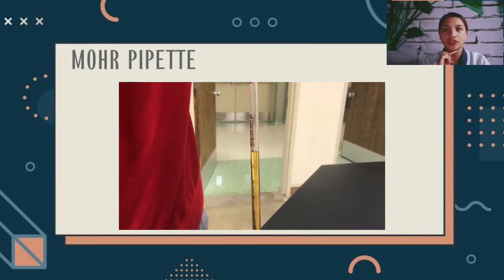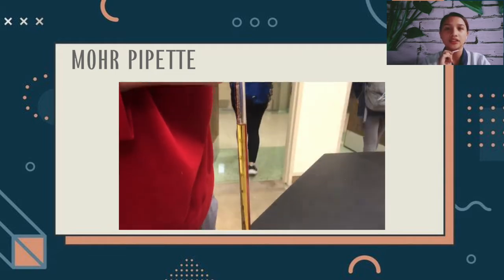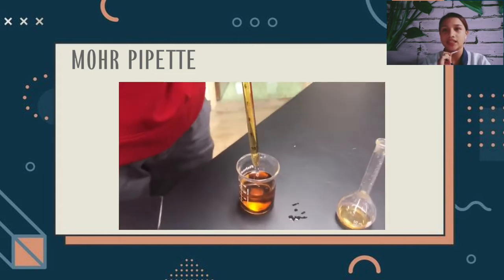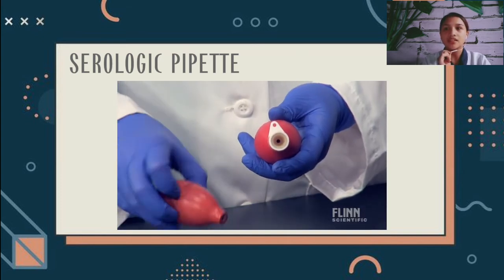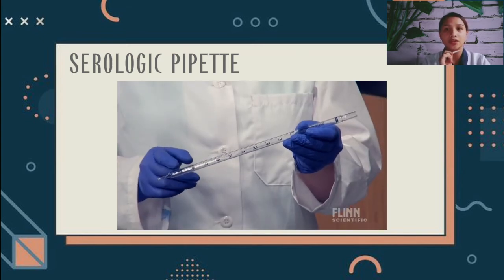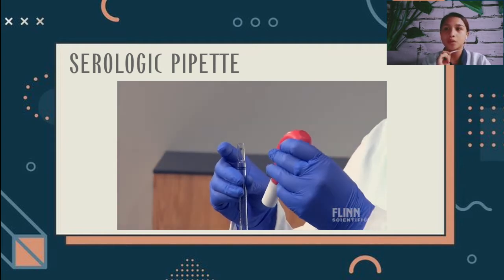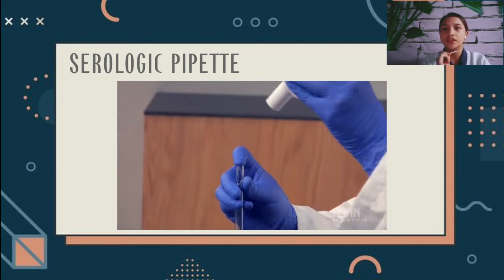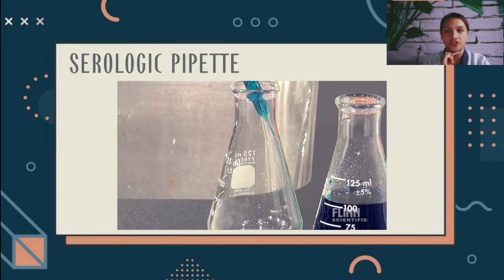It is a type of pipette used to measure the volume of the liquid dispensed, although not as accurately as a volumetric pipette. These use a series of marked lines to indicate different volumes. Serological pipette. The serological pipette is a laboratory instrument that transfers liquids measured in volume by mL. Most have graduations on the side for measuring the liquid being dispensed or aspirated. The use of serological pipettes is an efficient and gentle means of mixing cell suspensions.